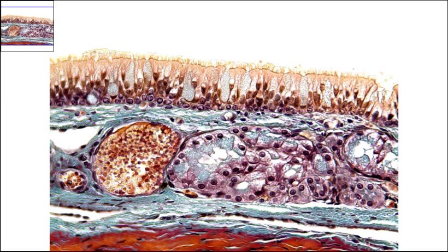This slide is from the trachea. The magnification you currently see is 400x total magnification. This slide shows us the ciliated pseudostratified columnar epithelium with goblet cells. It's this layer of tissue right here that is the pseudostratified columnar epithelium.